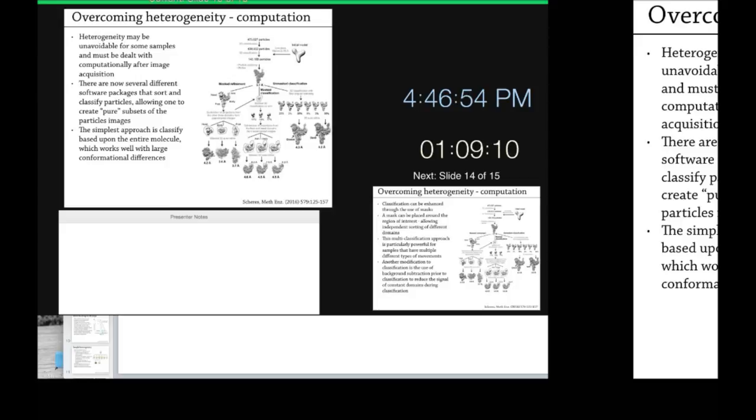And then you would check what your auto picking was doing. Like if you see it's really an ice block or an ice particle, you just unpick it, and you get a cleaner data set this way. Yeah. Okay. Yeah, and I think if you have the time, that's the better way to do it. But then you do introduce bias, because sometimes it's hard to tell if you have a small aggregate of 4 or 5 particles or if that's just particles that are aligned similarly but aren't actually touching, and so all should be good particles.